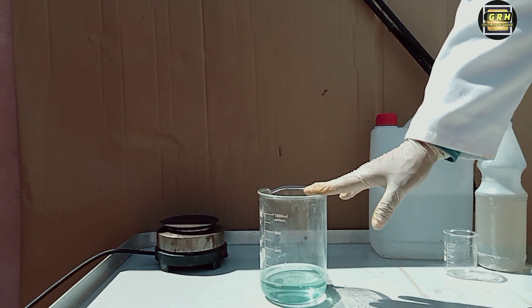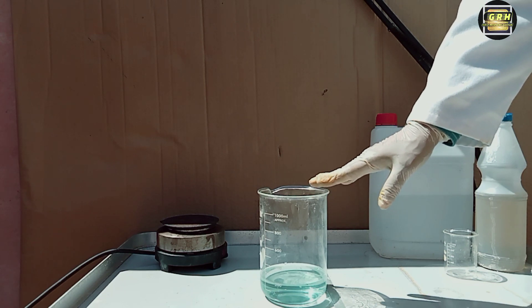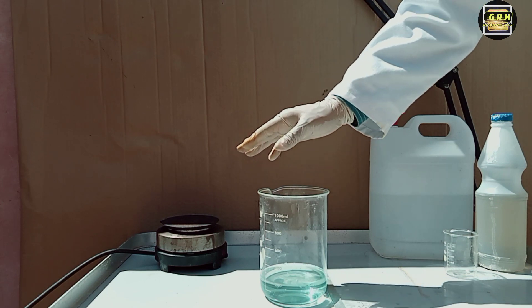Place the liquid, which is now a solution of iron sulfate, out in the sun and let it evaporate. You can evaporate it very carefully on the stove, but the sun is the best way.